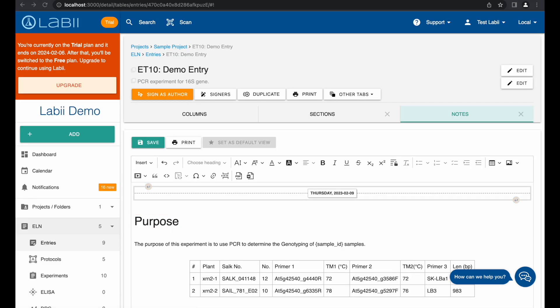Third, Labii Electronic Lab notebook allows for the insertion and preview of any type of file directly within the platform, eliminating compatibility issues between notes and files. Click on the Insert menu and then choose File.